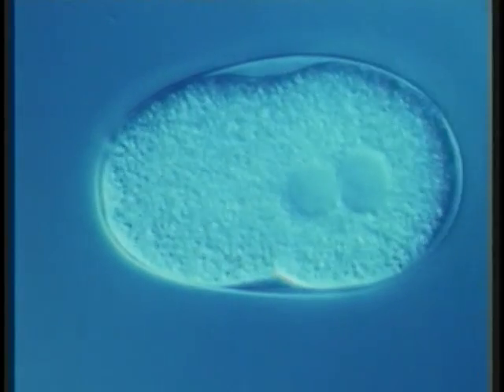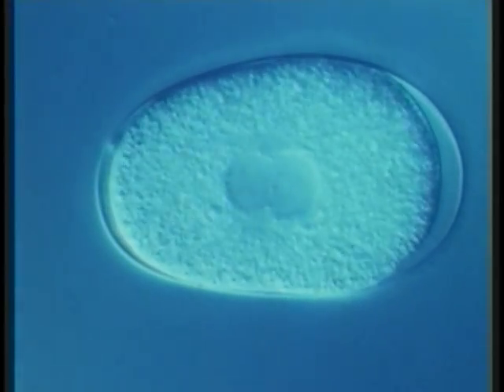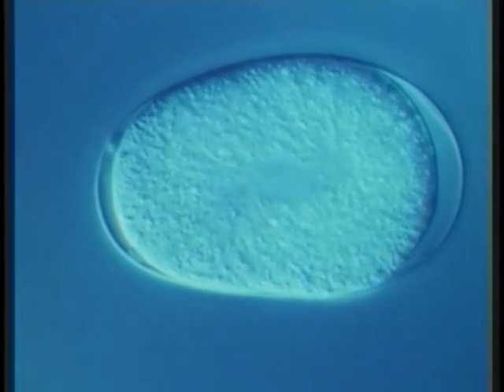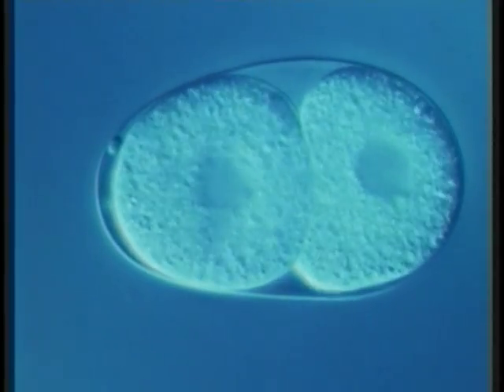This sped up sequence shows embryonic development of a nematode worm within an egg. The sequence starts with the two nuclei fusing and proceeds with the subsequent cycles of cell division that give rise to the worm. This organism goes from a single cell to an adult with 1,000 cells in about three days. Since the worm is transparent, the fate of each cell in the developing embryo can be followed.